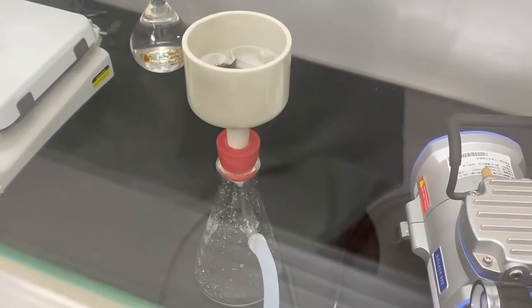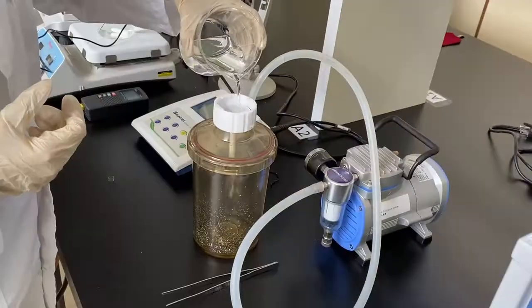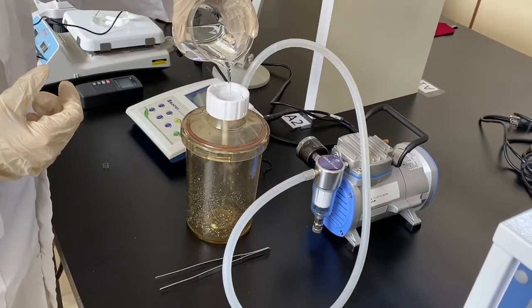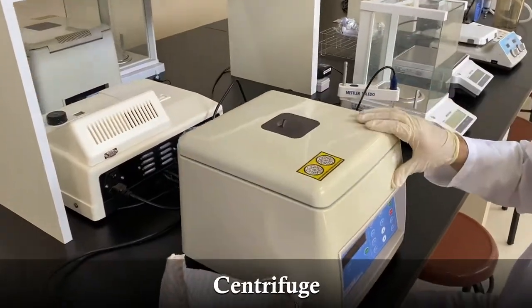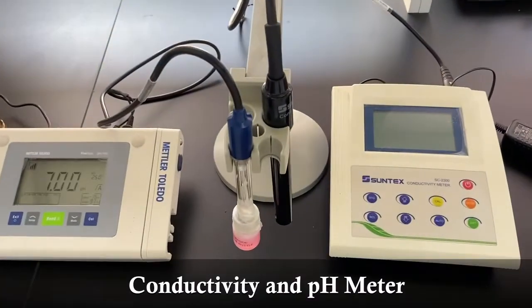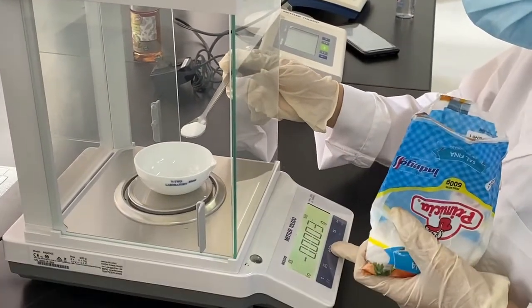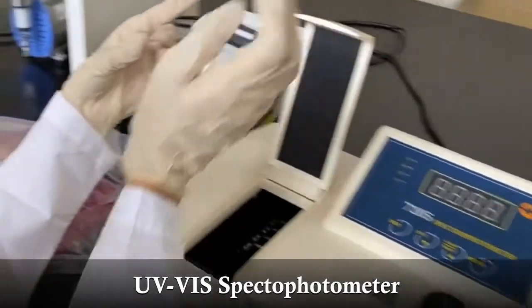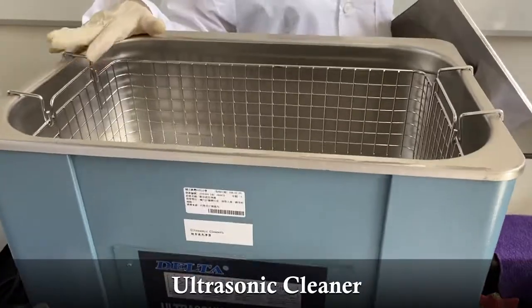We can mention the water bath, vacuum pump filter, centrifuge, magnetic stirrer, conductivity and pH meter, analytical balance, UV-Vis spectrophotometer, and ultrasonic cleaner.